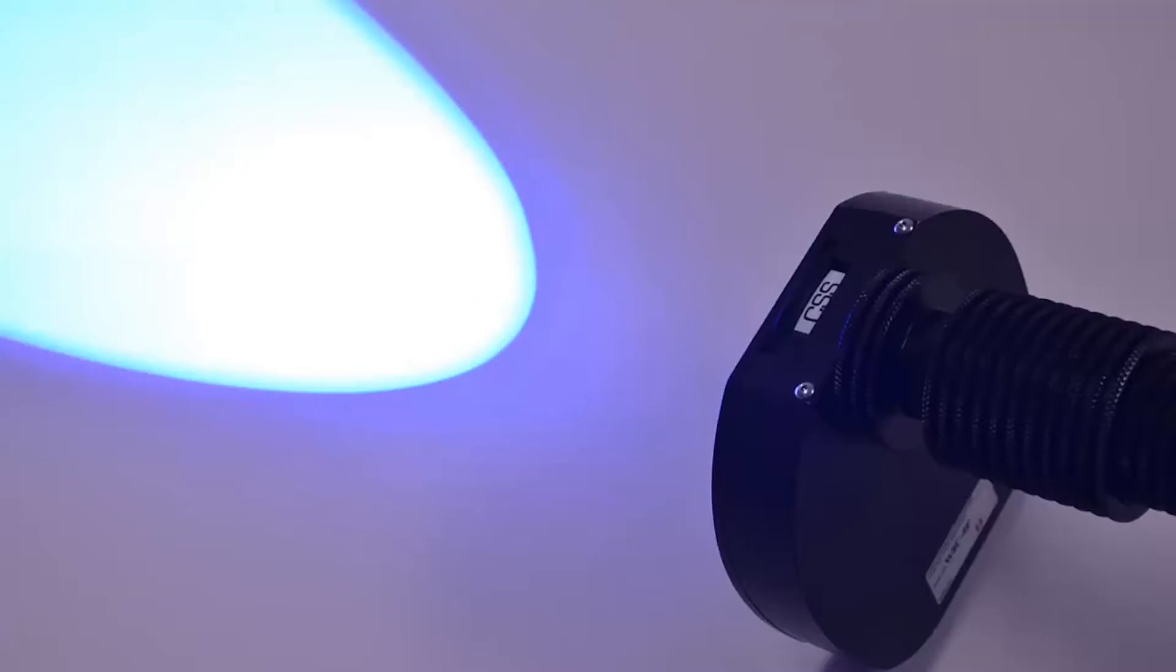When searching for biological evidence, it is best to start with a broad band pass or short pass wavelength. These are typically blue in color and are designed to cause most anything that can fluoresce to fluoresce.